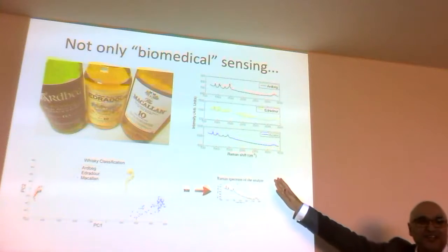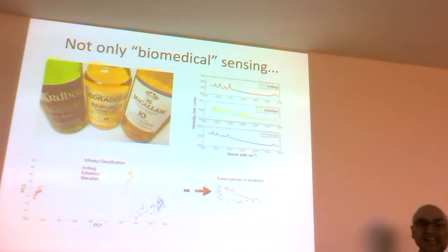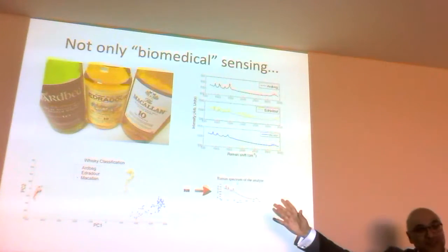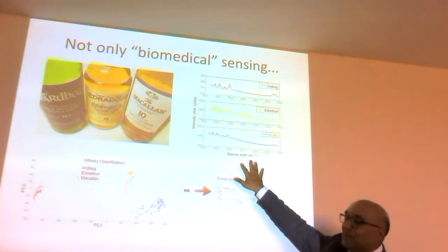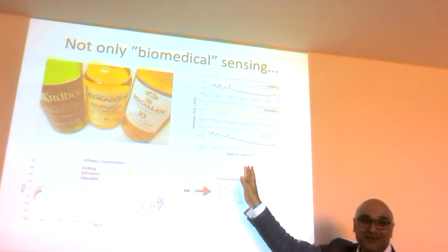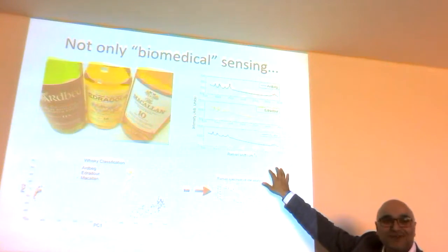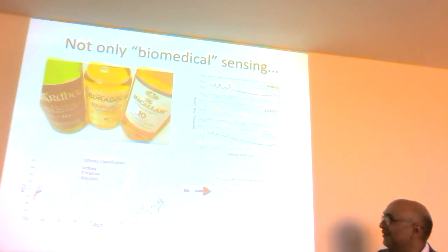So the Raman spectrum could go over tens to hundreds of nanometers. Okay, it's quite big. And it depends on what grating you use, as I showed at the beginning. But most chemists use this scale, which is why you always see it. But 1 cm to the minus 1 is 30 gigahertz, and you can then just convert that as you want into wavelength. I do think in wavelength as well, but from the chemistry point of view, Raman spectra are always plotted in this scale here.